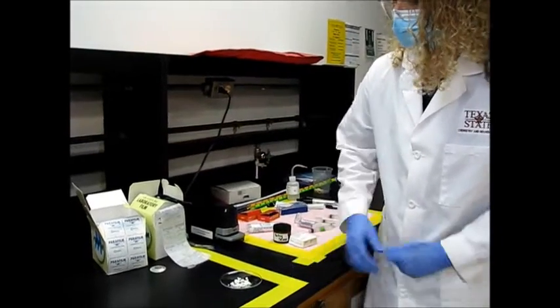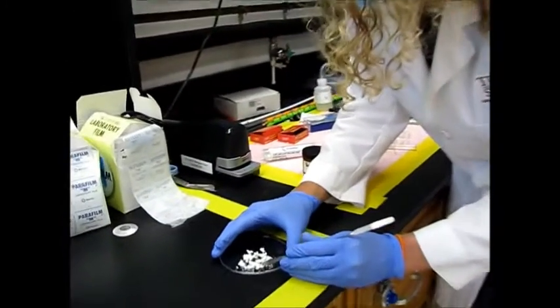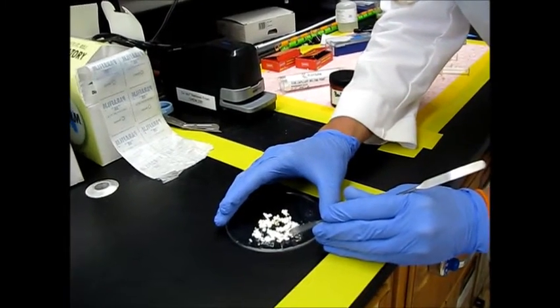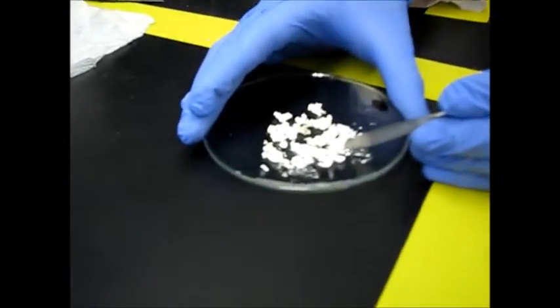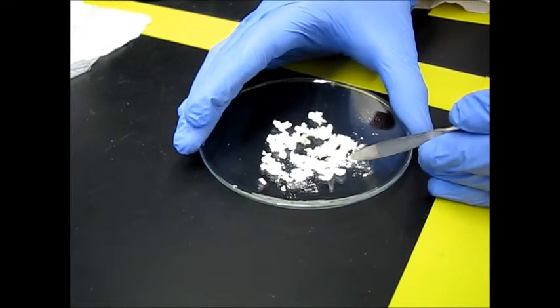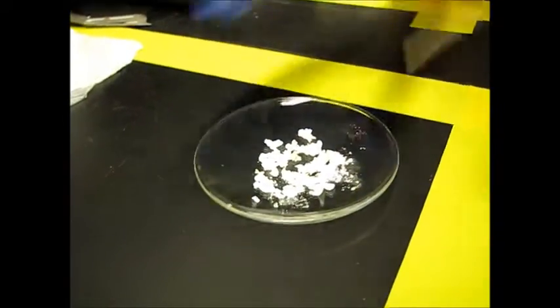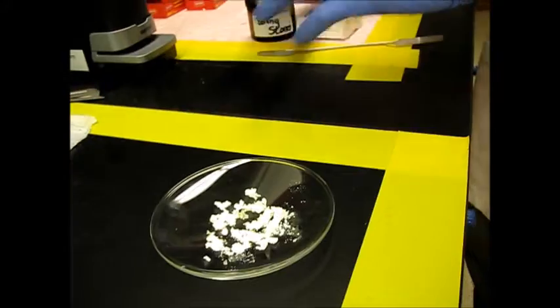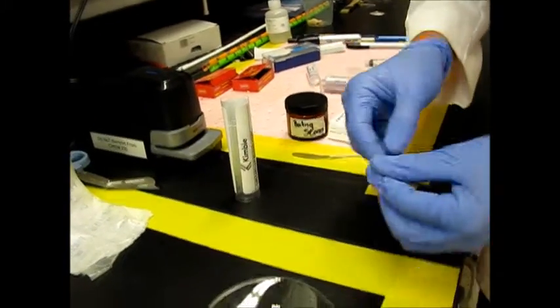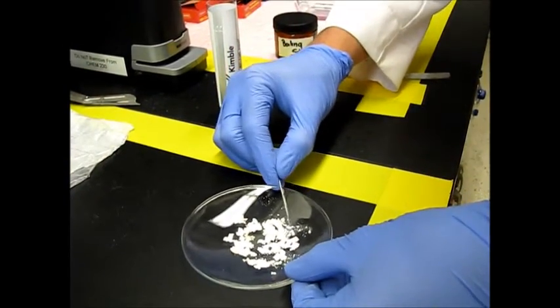So the last part of our analysis is a melting point analysis. We did this in OCHEM 1, but we're just going to go over it for this experiment here. So we're going to break up our product into nice small chunks. Cool, so that's probably good. So we're going to go ahead and grab one of our capillary tubes. And the best way to do this is you want to shovel it in, scoop it in like this.